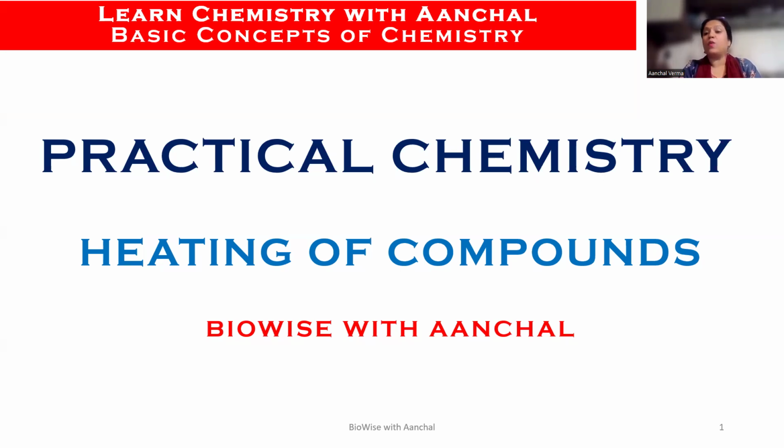The video talks about the action of heat on compounds and also flame test. So let us move ahead.